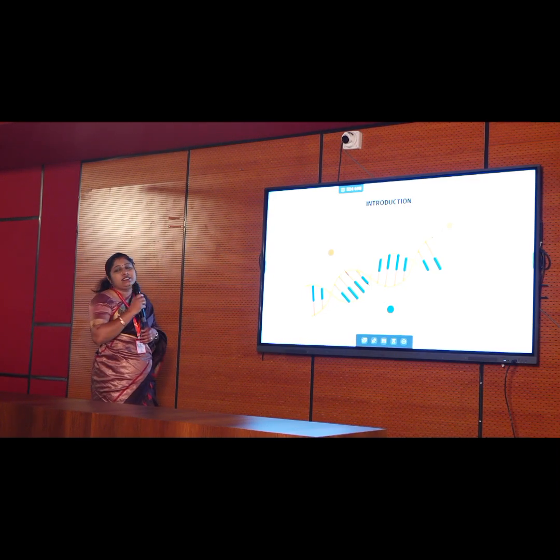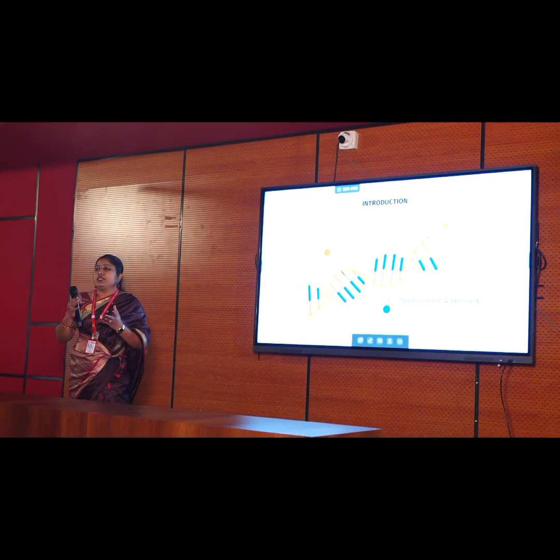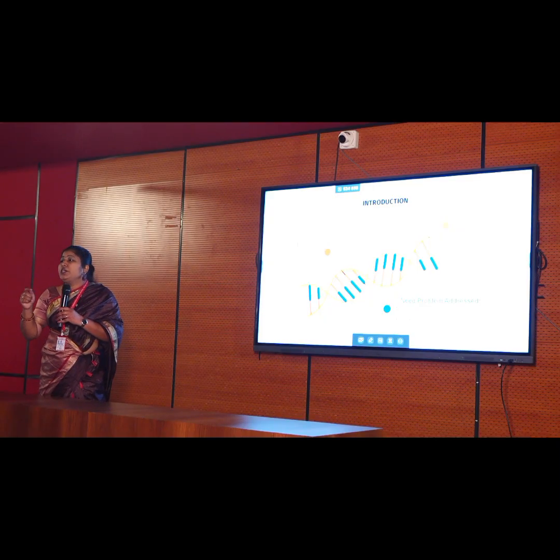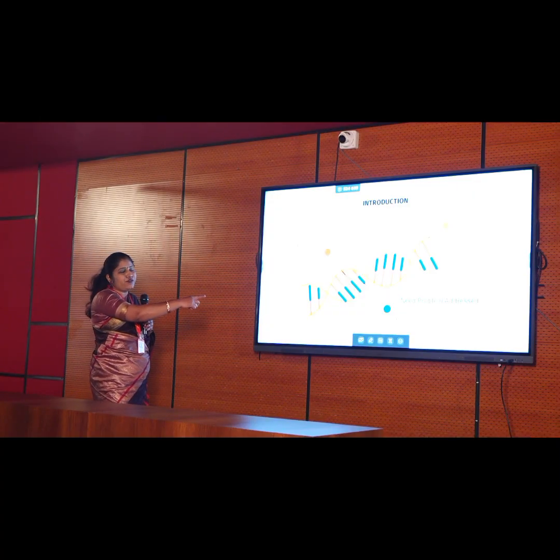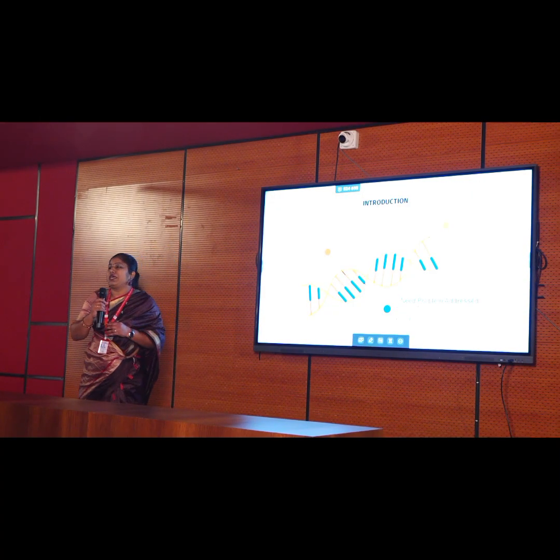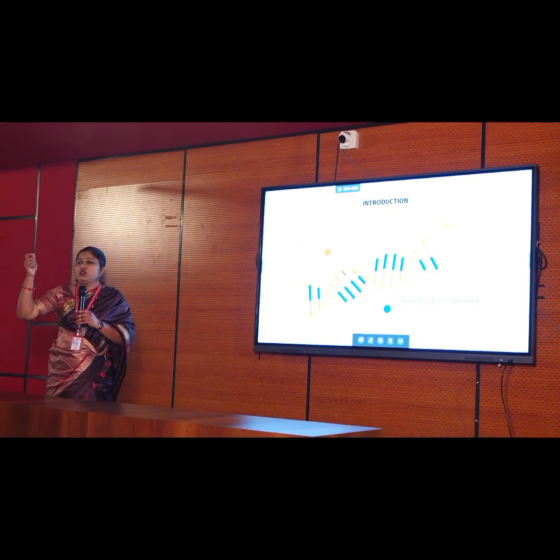As I said, DNA is the genetic blueprint of life. So what was the need? If I tell you theoretically that DNA looks like this or looks like a thread-like structure, it becomes difficult. But what if I actually show you how it looks like? That is the need we have addressed. Because it is difficult to grasp molecular biological concepts, we have done hands-on practice to show exactly this real life molecule, how it looks like, to the students.